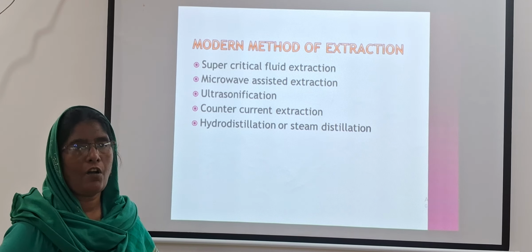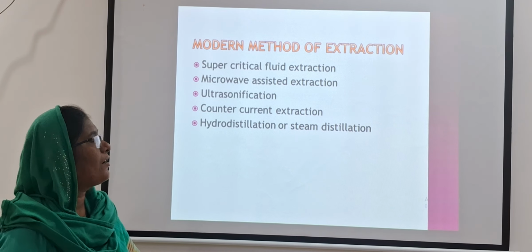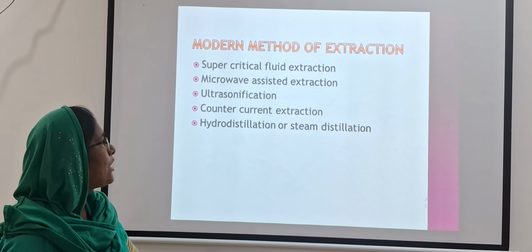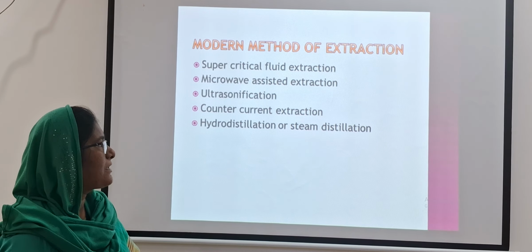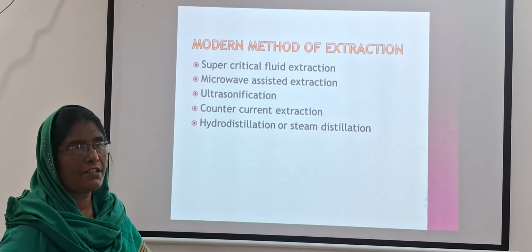Next we study the modern methods of extraction. Modern methods of extraction involve supercritical fluid extraction, microwave assisted extraction, ultrasonification, countercurrent extraction, and hydrodistillation or steam distillation for volatile oil. These are the modern extraction techniques.